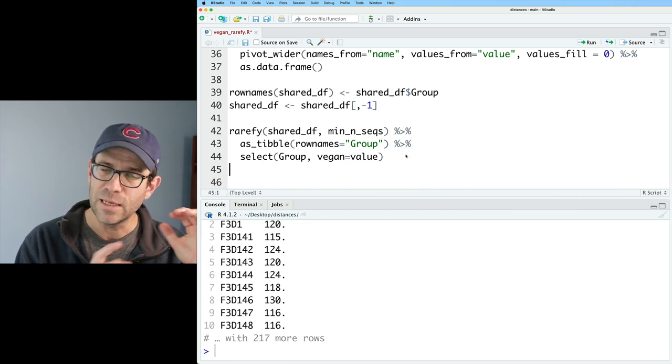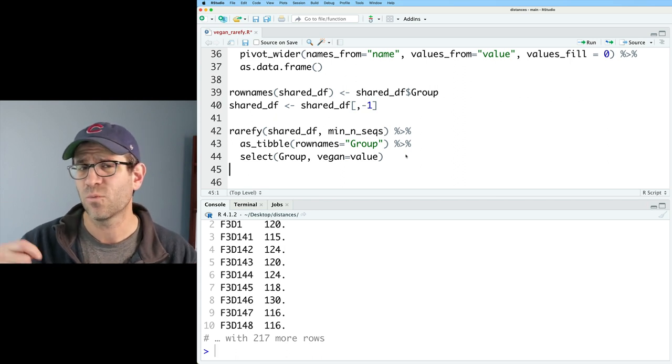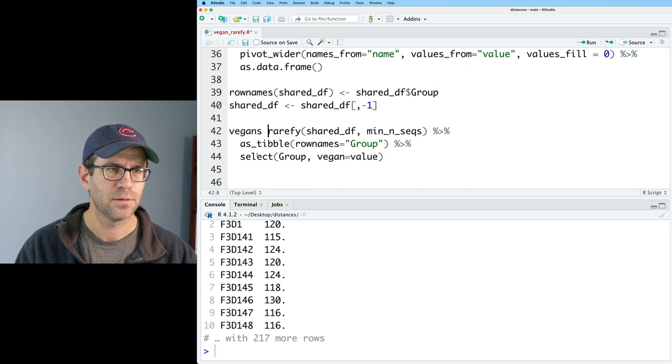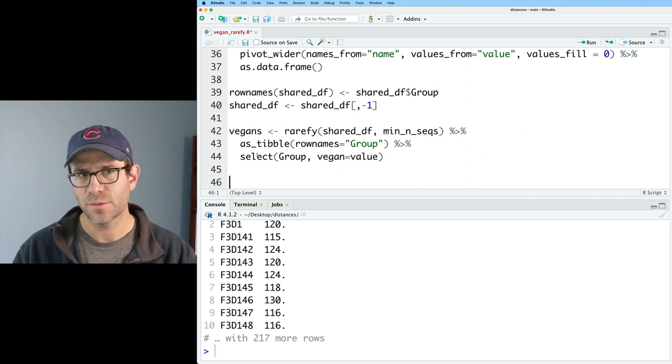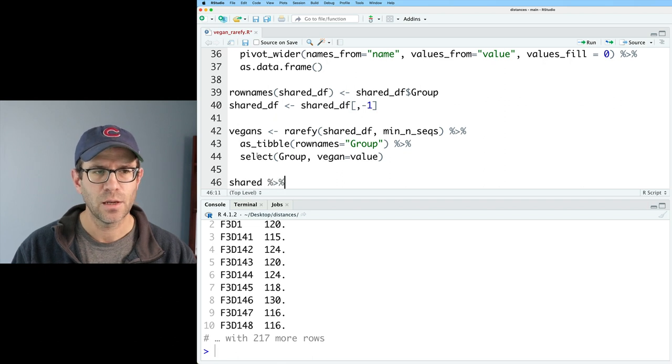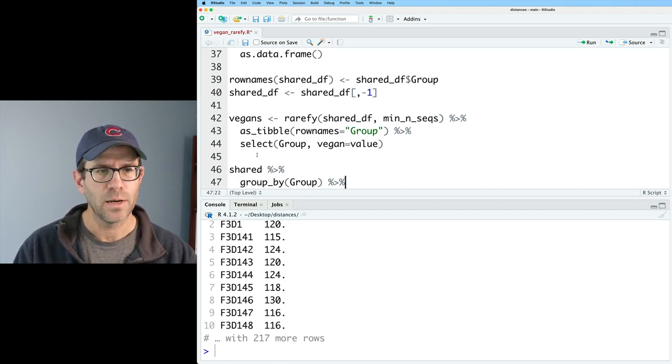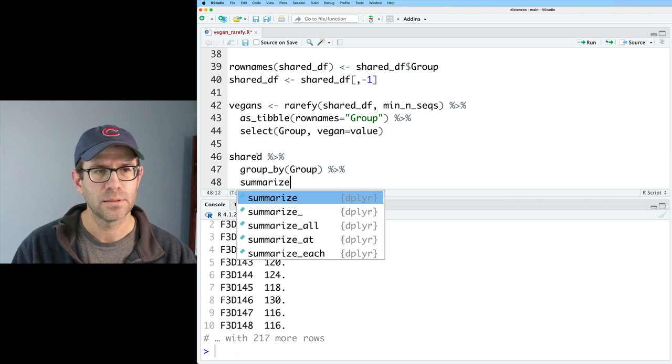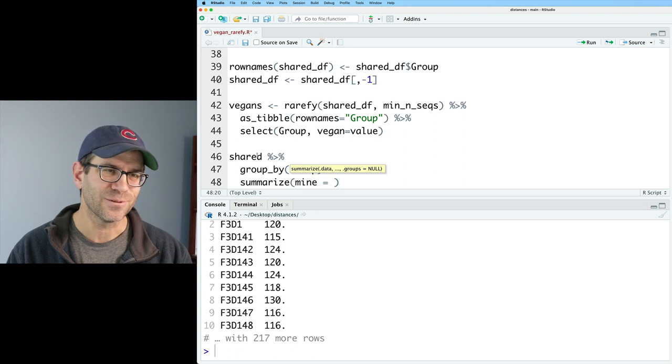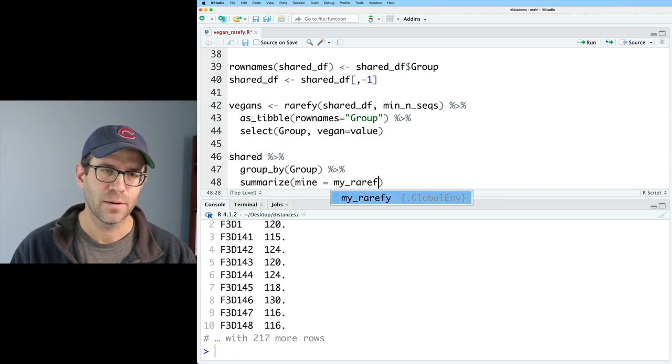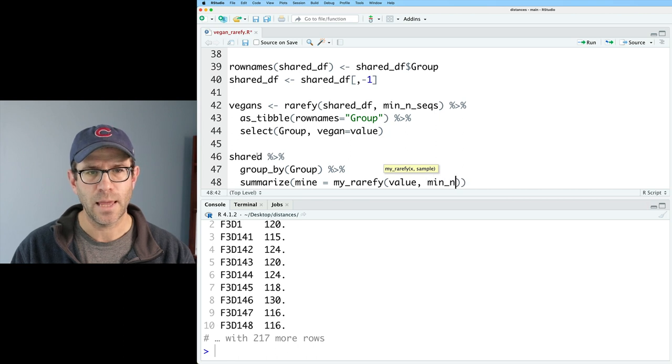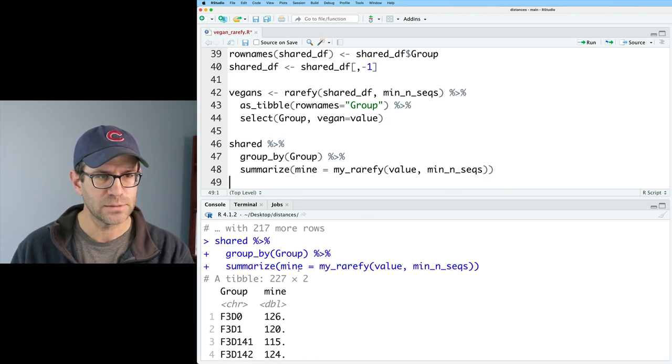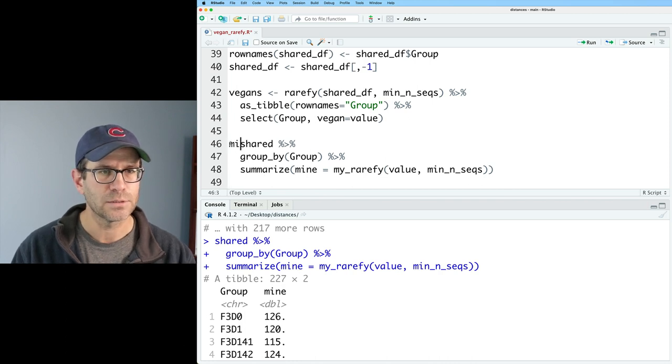I could also go ahead and pipe this and do a select group. And I'll say vegan equals value. And one thing I wonder is, is vegan using the exact rarefaction? Or are they using the bootstrapped, the randomized process? I'll call those vegans. And then I'm going to do the same type of thing, but with my_rarefy. And so again, we'll have shared, and we'll pipe that to group_by group, right? And then we'll do a summarize. And we will say mine equals my_rarefy.